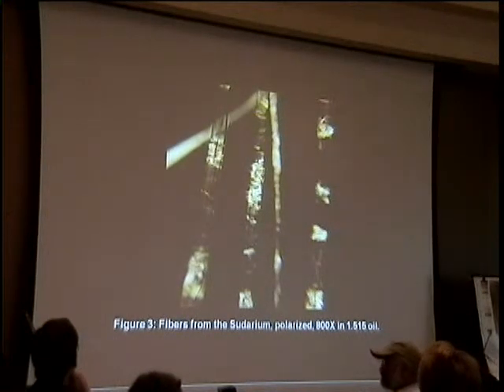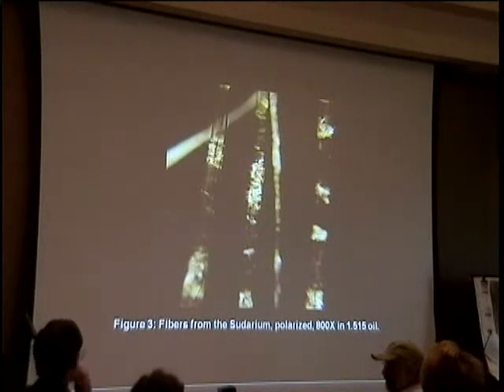Defects change with age. Free radicals react with other materials and each other. Strained, high free energy zones age more rapidly than unstrained ones. Dark streaks of the same dimensions as fresh defects can be observed in old fibers. Some are quite clear in Figure 3. The decay of birefringent zones and ion tracks seem to indicate significant age. There is not yet enough data to use the observation for age estimation.